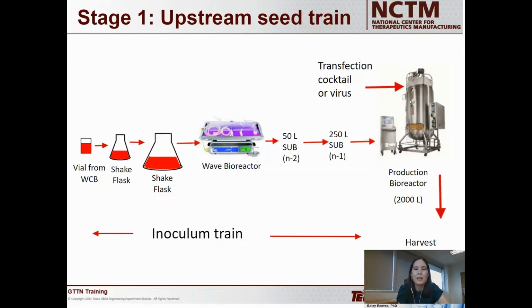What happens at that point is those viruses go in and start infecting the healthy cells in your reactor, making more copies of themselves. And it's through this infection process that you're able to actually reproduce those viral particles and make your viral vectors, which is ultimately your product. At the end of that infection, you will harvest the material, and you'll basically start by separating out your viral vectors from all of the other junk that you've produced to this point.